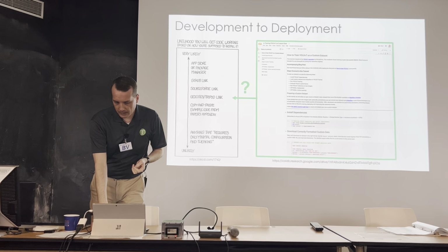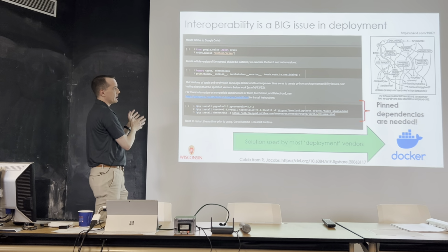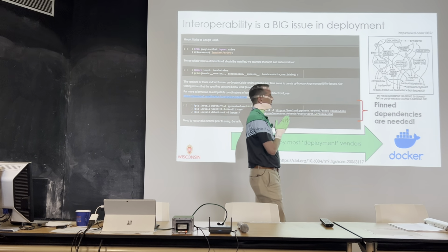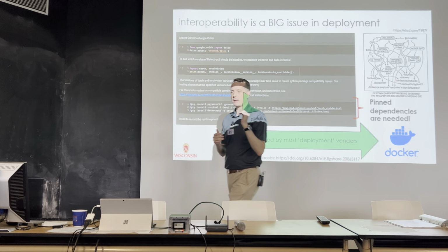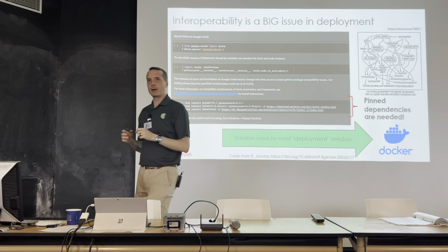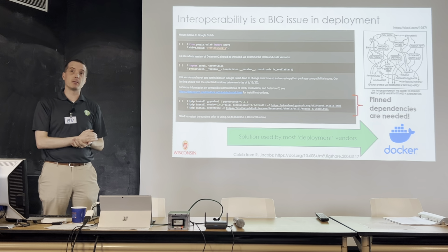And then there's also the problem of interoperability. We're trying to move from developed to deployed and have people think about deploying this model and giving this code to other people. And then you also have the wonderful Python dependency management, which I could spend the rest of the talk griping about. A large part of this has been solved with Docker, but again, no microscopist is ever going to know what Docker is or how to use it. So we need some way to take all of this, package it in a way that other people can use, and put it onto a microscope.